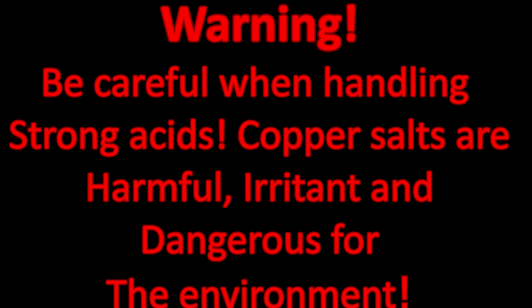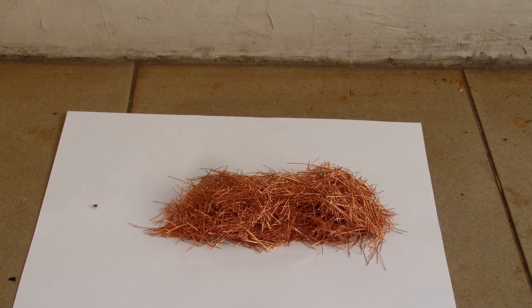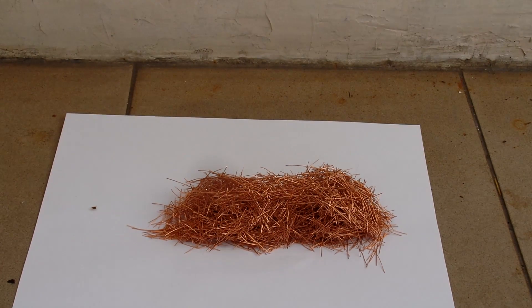Be careful when handling strong acids. Copper salts are harmful, irritant, and dangerous for the environment. In this video, I'll show you how to make copper sulfate from copper metal.